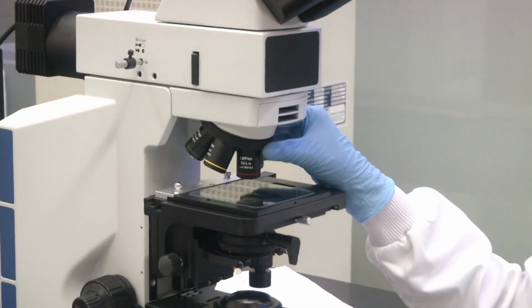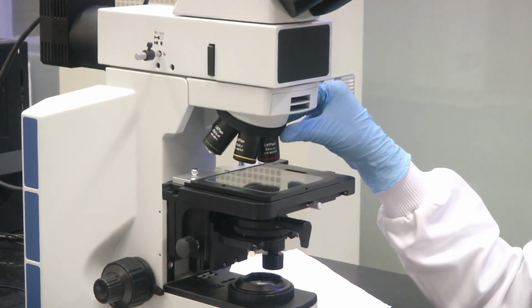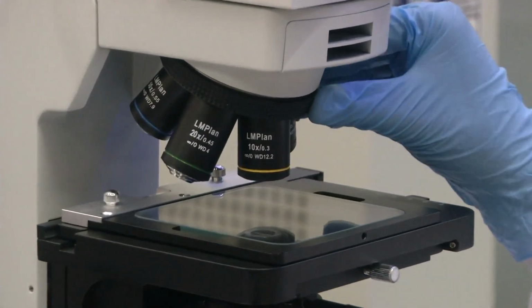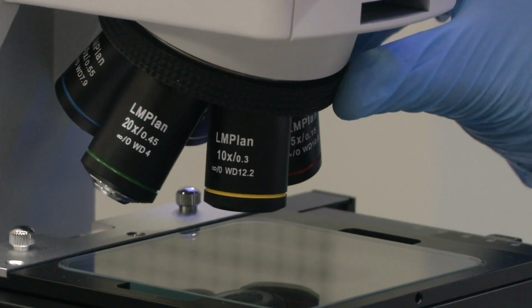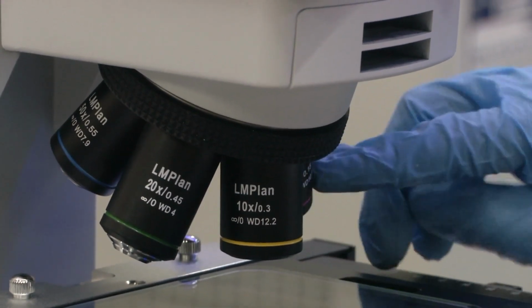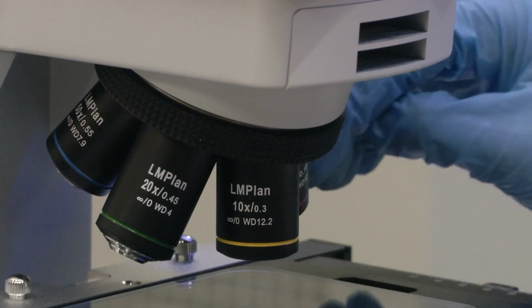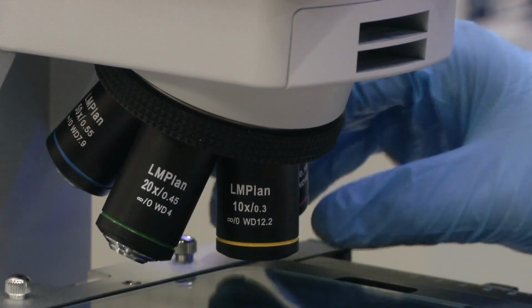Now, suppose I adjust the turret. You can adjust the turret. As you see, the turret will move and get locked onto the next objective. Once it gets locked on, you can hear a click sound. I am not sure whether you can hear it, but there is a click sound and the next objective comes into position. Each objective is usually marked with a color, because as you use it over time, you will just look at the color and know which magnification it is.